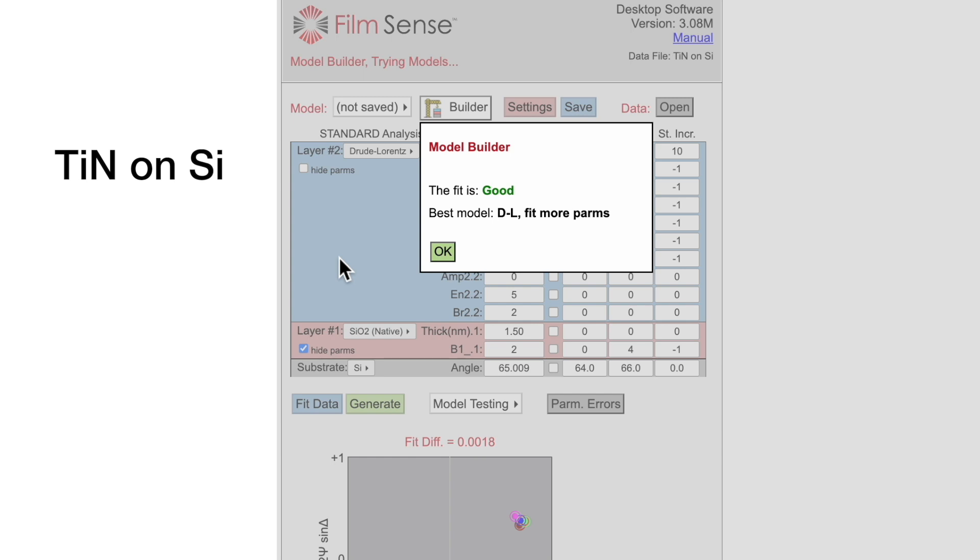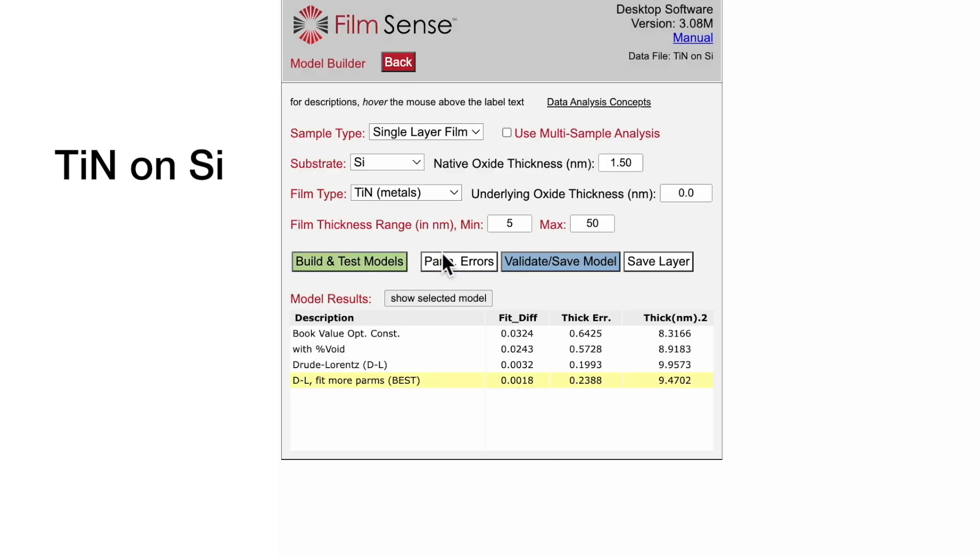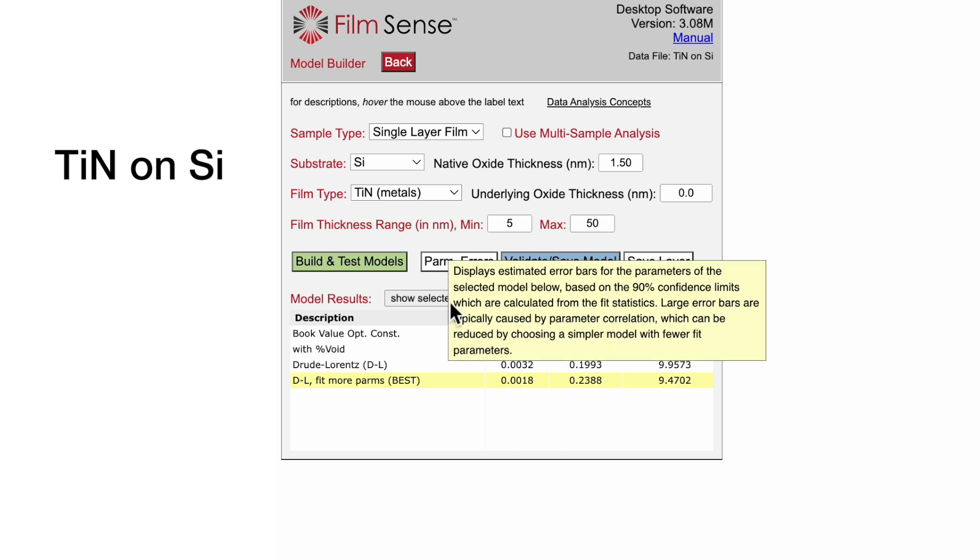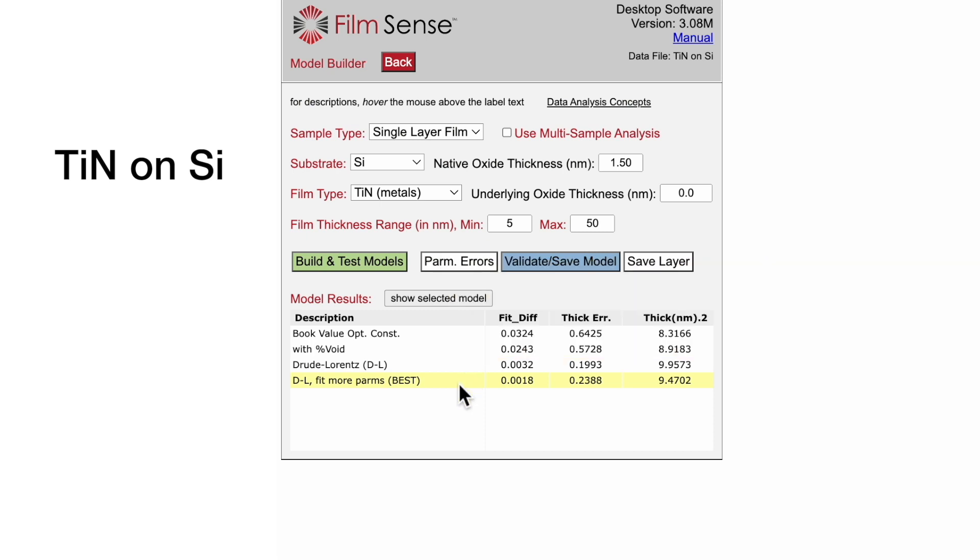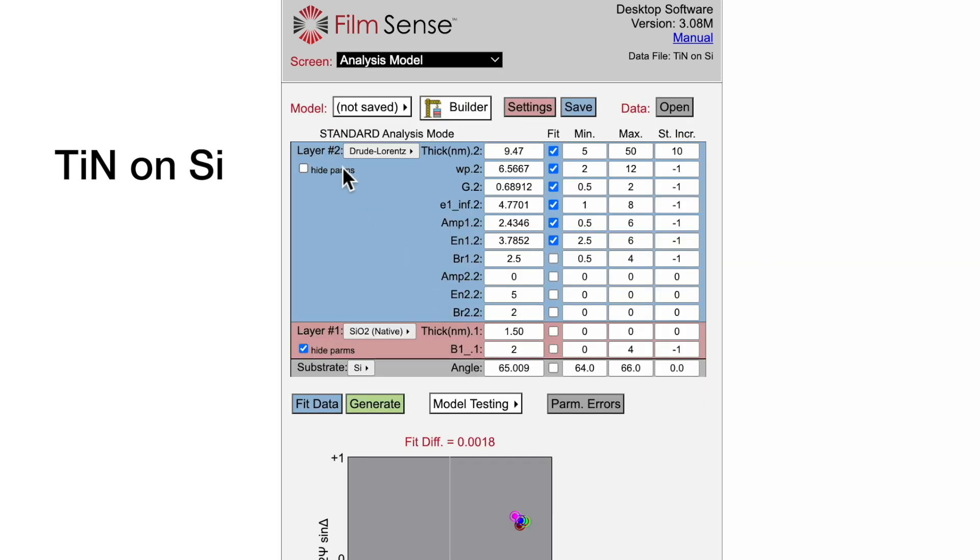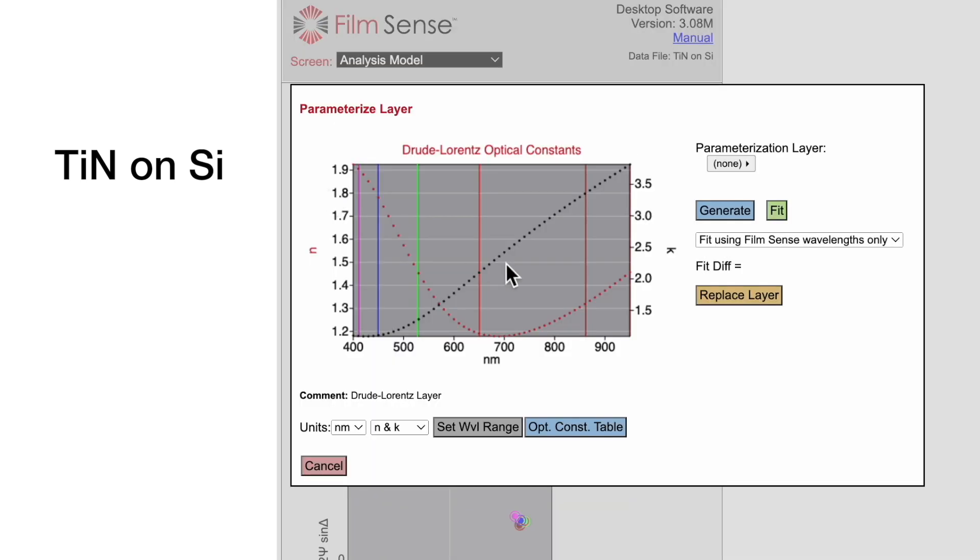The fit is good with a Drude-Lorenz model that fits for more parameters. Looking at the N and K curves, we see large K values with increasing longer wavelengths due to the free electron absorption which correlates with the high conductivity of the metallic film.